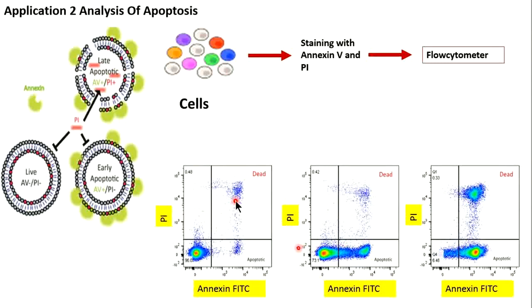You can do this experiment in a time dependent manner also. You measure this after 12 hours, after 24 hours, after 36 hours, after 48 hours. So you can also find out how much time it takes for your drug to kill the cells.